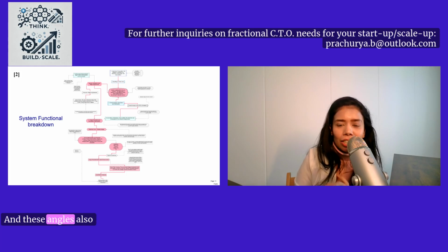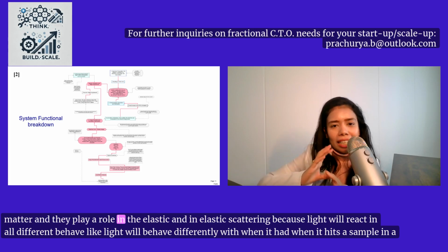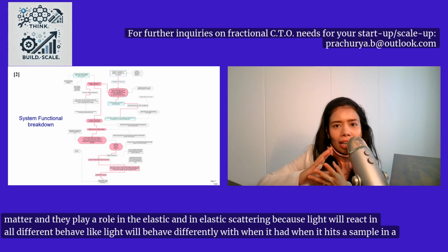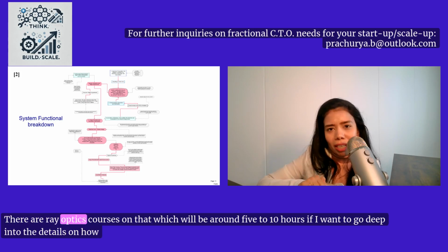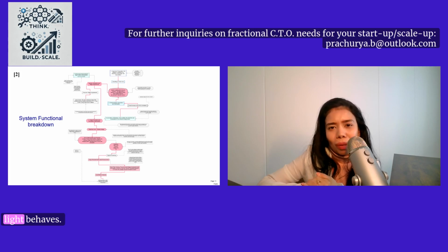And these angles also matter, and they play a role in the elastic and inelastic scattering, because light will behave differently when it hits a sample at a particular angle. There are ray optics courses on that, which will be around 5 to 10 hours if I want to go into the details on how light will behave.